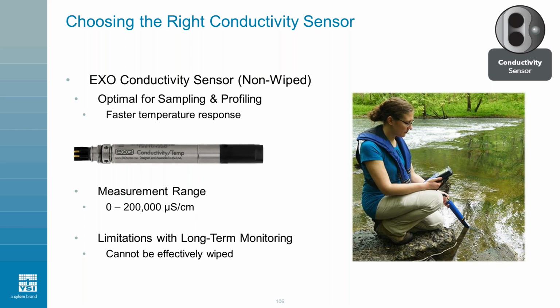So those of you in that very high measurement range, there were a few, would be more interested in this sensor. Anyone that is interested in monitoring in extremely high conductivity environments, this is the sensor for you. And additionally, at least on paper, this sensor does have a higher reported accuracy.